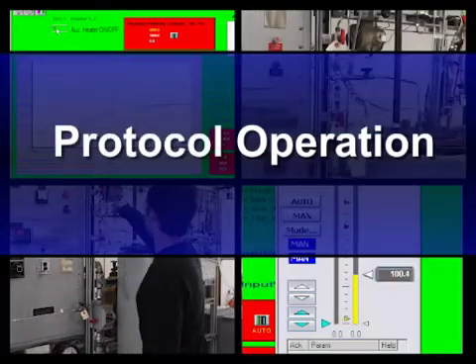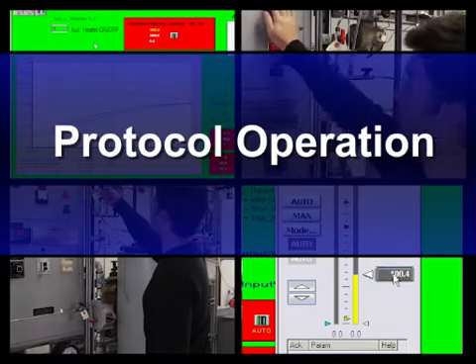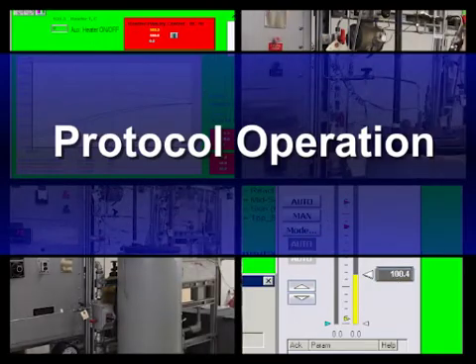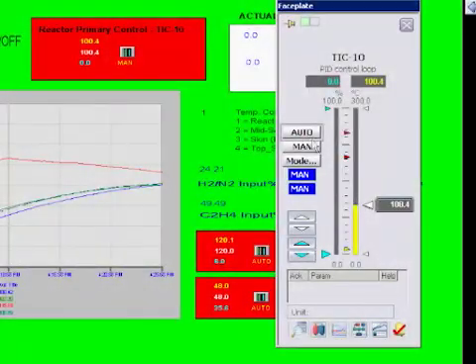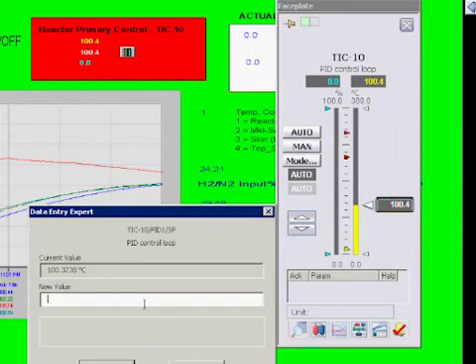The reactant gases may now be input to the catalytic reactor. Turn on the sand bath heater and enter the temperature set point.